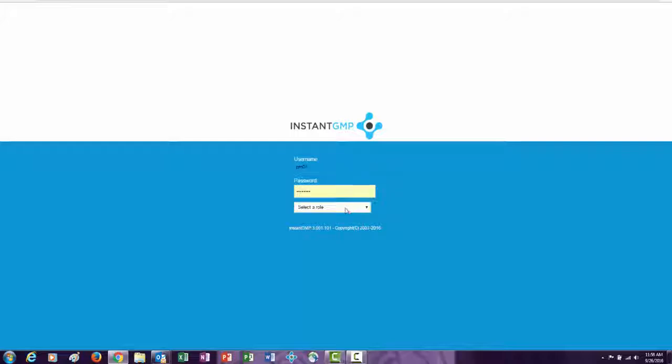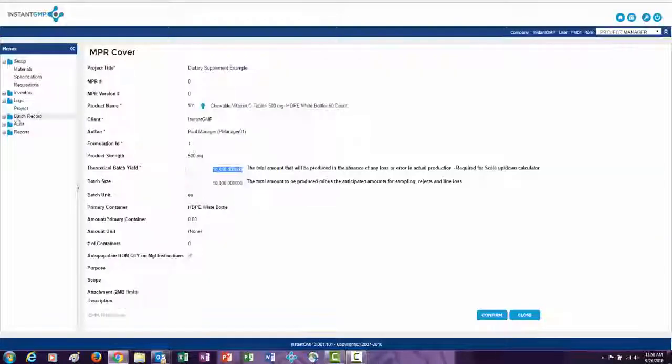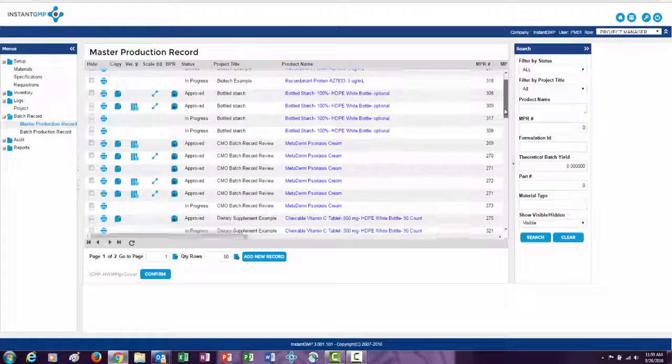First, we'll log in as a PM. Then, we're going to navigate to our master records. We're going to choose a record that has been approved.